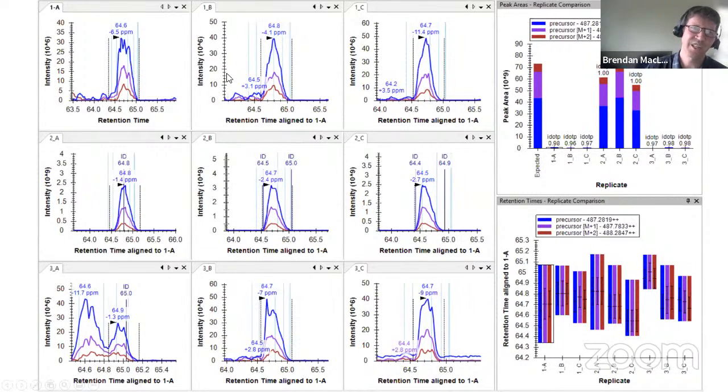So it's not clear why the mass spectrometer didn't sample it, other than the fact that it is quite a bit less abundant. The middle ones are where it's really high intensity, up around 3 billion ions per second. And down here, we only have tens of millions of ions per second. And frequently we're not sampling it because that's the way DDA works.